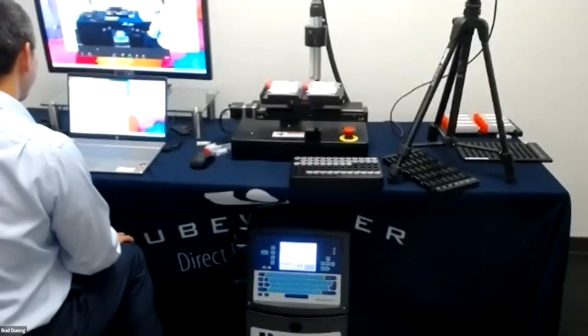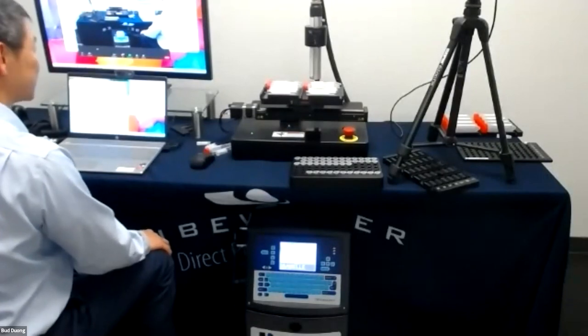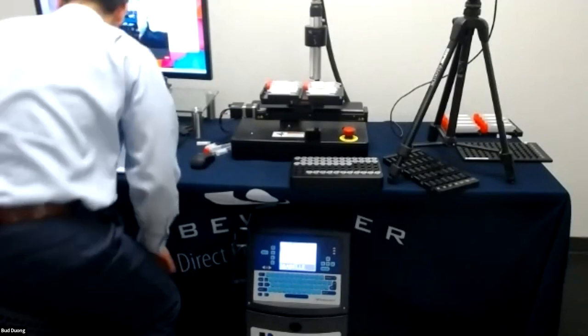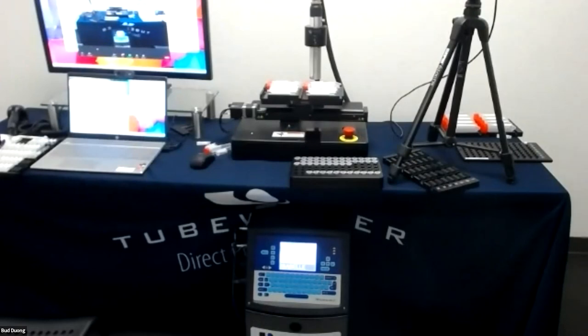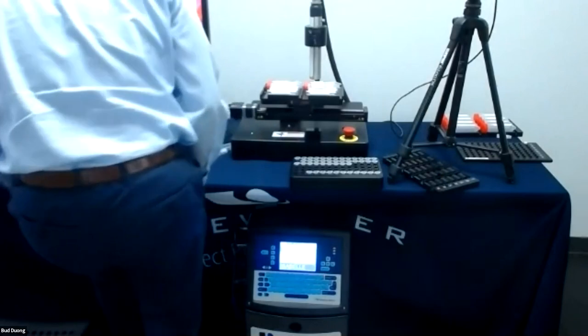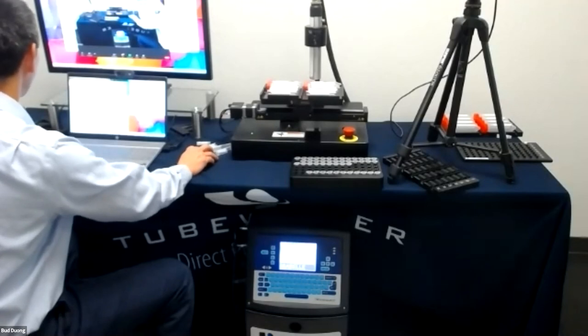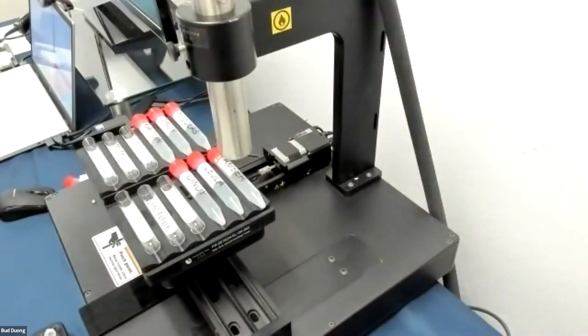One question we missed: can you print in different colors? Unfortunately, we can only print in black. But let me show you something interesting — I happen to have a tube from another demonstration. There's printing on an amber tube, and it actually shows up better than you might think. Certainly you wouldn't see it on a black tube, but on colored tubes it works well.